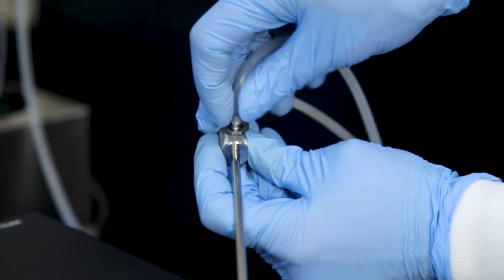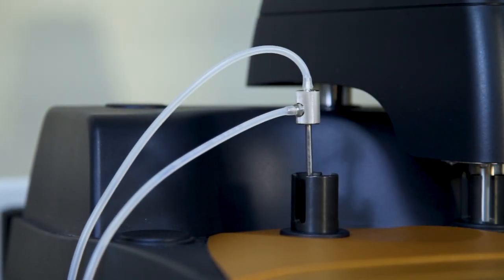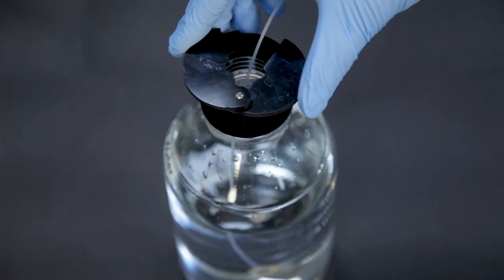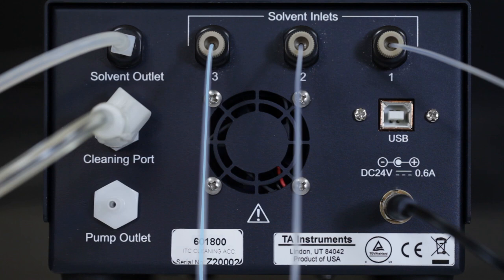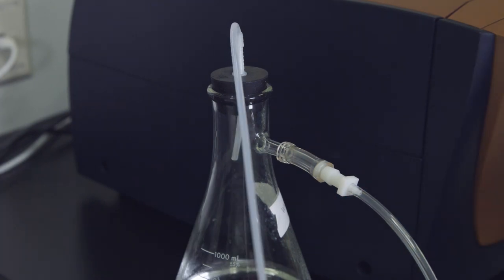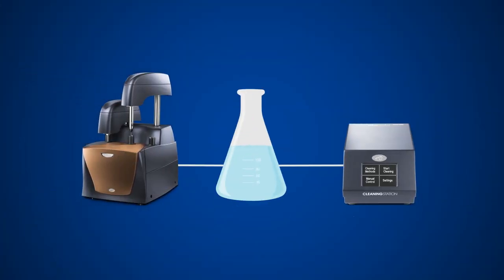To use the TA cleaning station for an ITC system, the cleaning tool supplied with the instrument is placed into the reaction cell. Solutions from the back of the cleaning station are pumped into the line and then delivered through the tool. Solutions are then pumped to the waste reservoir. While the cell is being cleaned, the fully automated cleaning of the Affinity ITC injection syringe can proceed without user input. Bottles used for the cleaning station can also be used for the syringe cleaning.